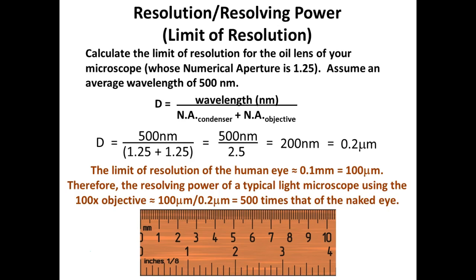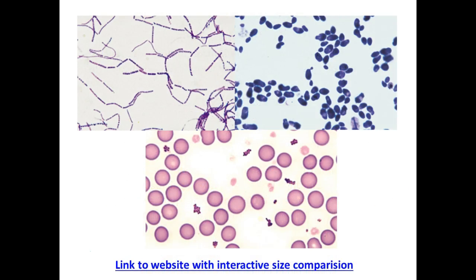Pretty impressive. So this is the types of things that you'll see. Good old bacteria, right? These are actually rod-shaped in chains. Here's some yeasts that are even budding. Here's a red blood cell and a cluster of cocci-shaped bacteria.